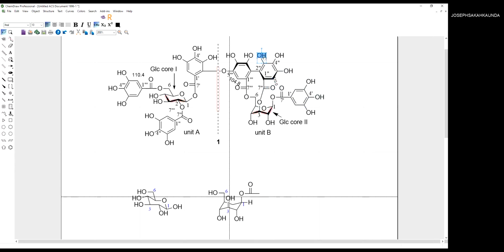This is far away, you know. If you have a proton here, you have J1, J2, J3 is quite far. So you will likely get this one, these two, and then this guy and this guy. You may not see this. So you leave it pending for some time.